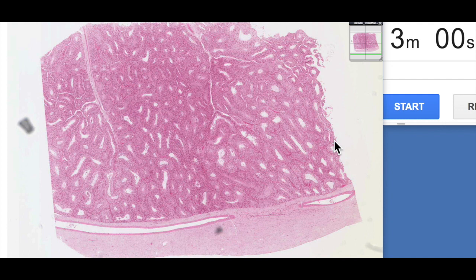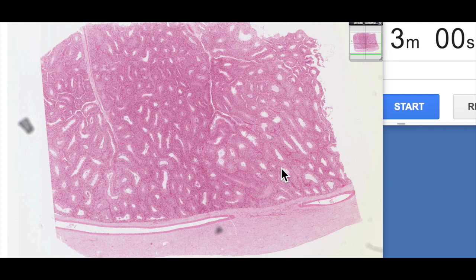G'day everyone, Jamie Chapman for 3-Minute Histology. In this video, we're going to be looking at spermatogenesis — that's the process of formation of sperm in the seminiferous tubules — and we're going to be using this lovely section. This is a section of the testis from a monkey, processed into resin, sectioned very thinly at about one and a half microns, and stained with hematoxylin and eosin. Resin sections produce really high-quality sections, so we'll see the morphology of sperm and other cells like you've never seen before.